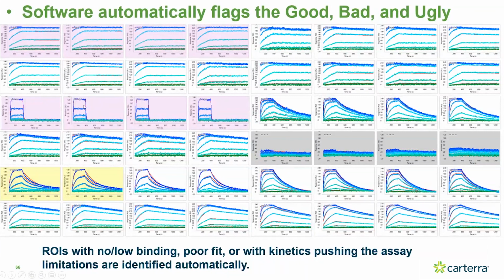So we were actually slightly above, but it's having a hard time estimating that because we don't have any sort of convergence in the concentration data. So it will flag things that you also may need to consider injecting higher concentrations. It will report rate constants for both of these kinetic limitations. It just flags them for you so you're aware of them.